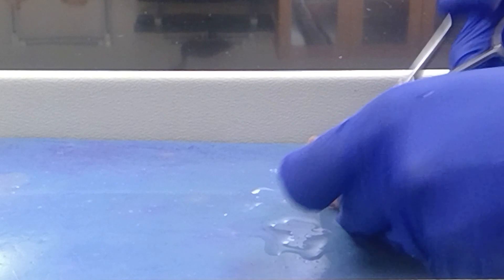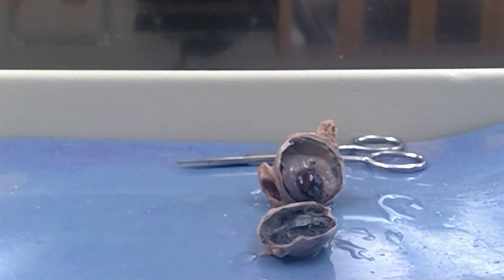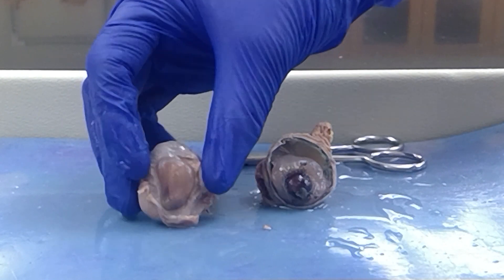Almost there. Okay, so now you can see that I have separated the anterior eye from the posterior eye.